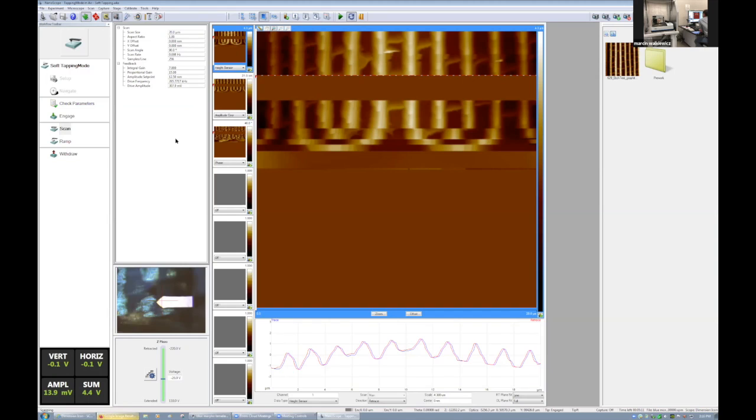Historically, a long time ago, people used to make probes out of super sharp shards of glass. You would have to be really, really good with micromanipulation to attach it to a steel cantilever and then put some foil on the back to reflect the laser. Now they're all made in a semiconductor facility, out of silicon through a micromachining process. Depending on whether it's stiff or soft, it's made either of silicon or silicon nitride, but this is all made just like the microchips, in a similar fashion.